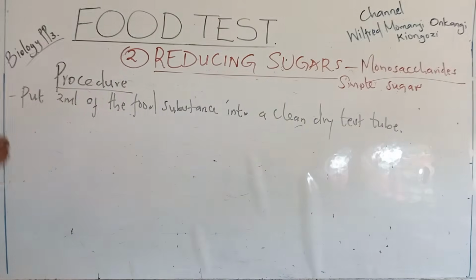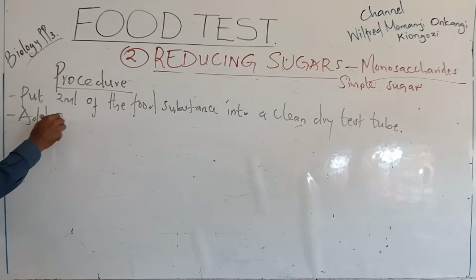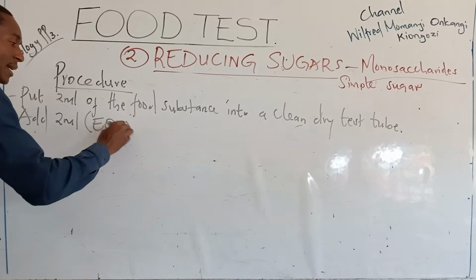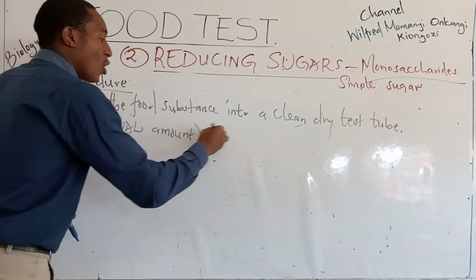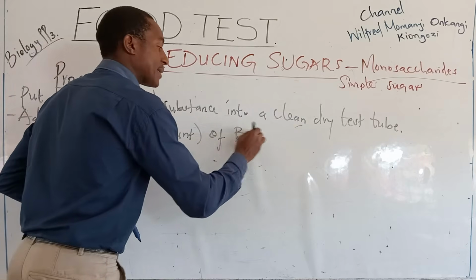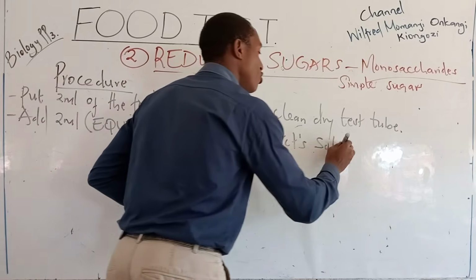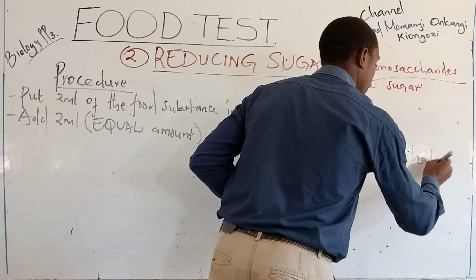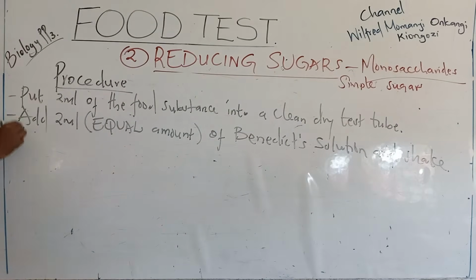Then you add an equal amount, so 2 ml. I want to stress this in capital letters: equal amount of Benedict's solution, and shake.